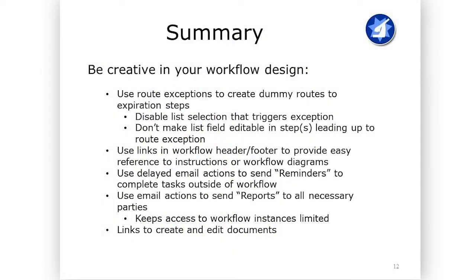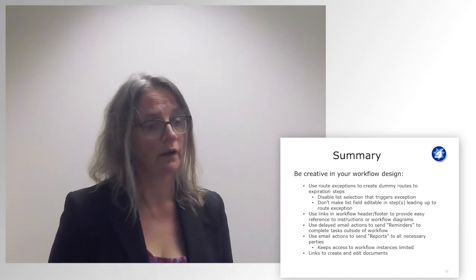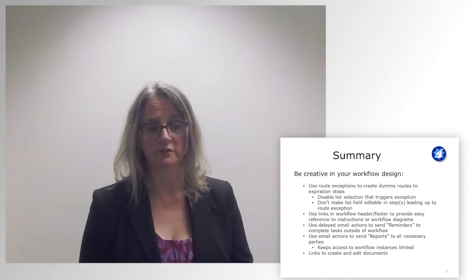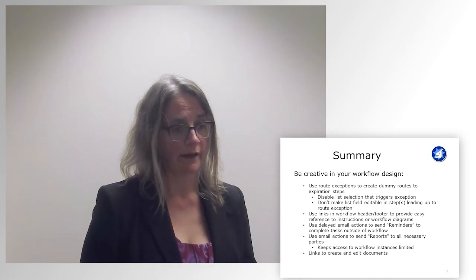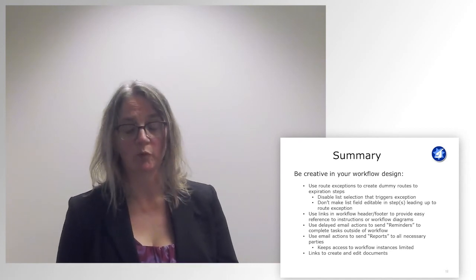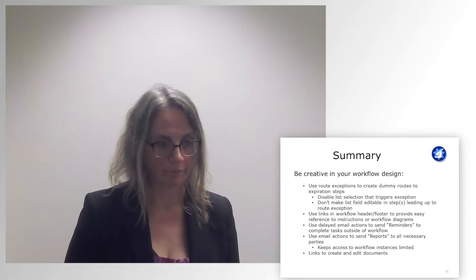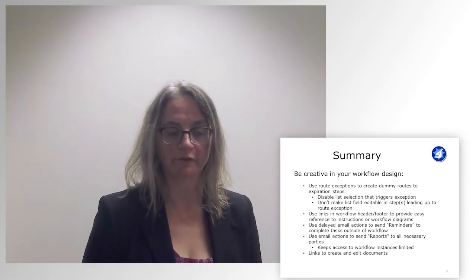So in summary, don't be afraid to be creative in your workflow design. You can use dummy route exceptions and disable the list that triggers the exception, or just not make it editable. You can use links in your header and footer to provide easy reference to instructions or workflow diagrams. Use delayed email actions to send reminders or email actions to send reports. And keep your access to the workflow instances limited. You can also use links within your workflow to create and edit documents.